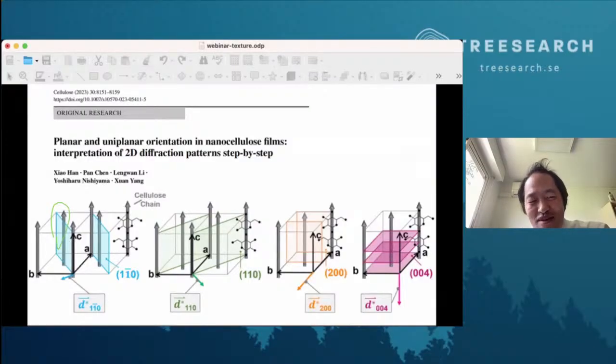But of course, 2D diffraction is the first one which was ever recorded, and diffractometer is much more sophisticated because you need some control of the orientation. You need a goniometer. And so she was writing the draft, and I was correcting and trying so that she would understand what's happening in the pattern. So the drawing I'm presenting is drawn by her.